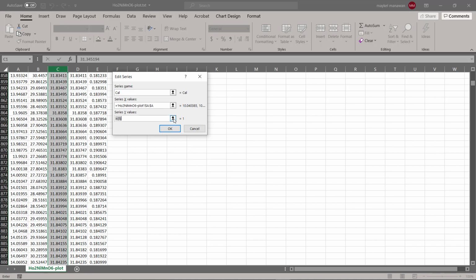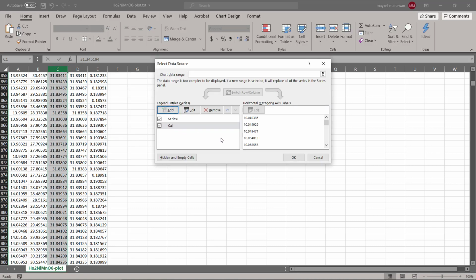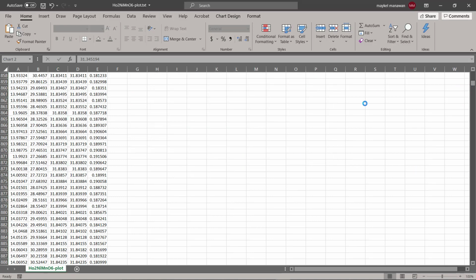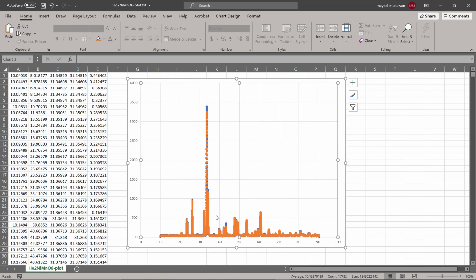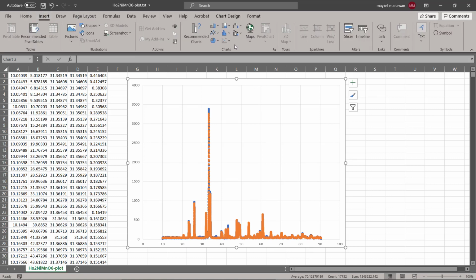Then B is this guy. Okay, it's okay. Let's see. All right. But as you can see, I don't know how to modify this file.